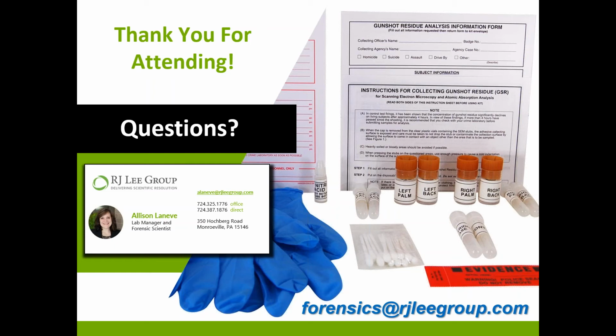So for example, if you have a garment that has biological or suspected biological material, you can still collect for gunshot residue first, because I can just avoid the areas of that suspected biological material, and then it can go on to DNA. However, if DNA is collected first, that's also fine. We can still collect primer residue after DNA has been collected. I hope that helps.